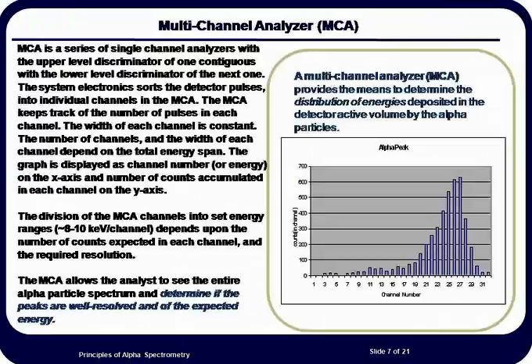The sophistication of instruments has increased significantly over the last 70 years. We no longer use single channel analyzers to measure the alpha particle emission from a sample. The electronic circuitry in instruments can measure the energy of the incident alpha particle and distinguish between different responses from alpha particles of different energies. It then can save and accumulate each of these responses separately in a storage location for each energy. We continue to use the term channel to identify these storage locations.